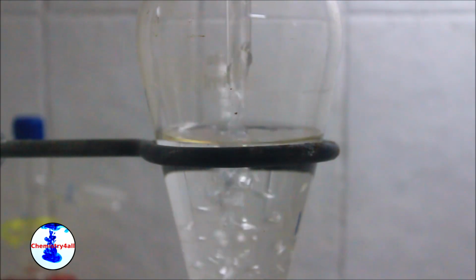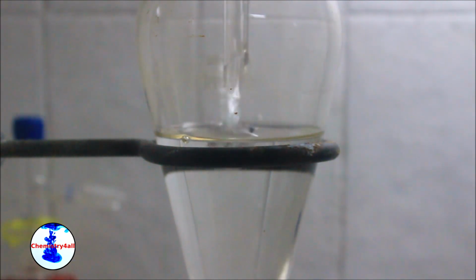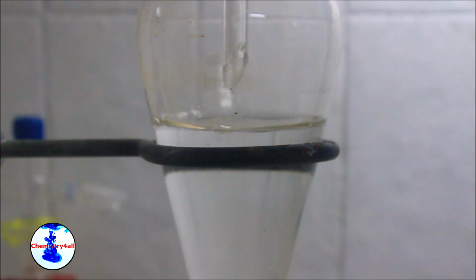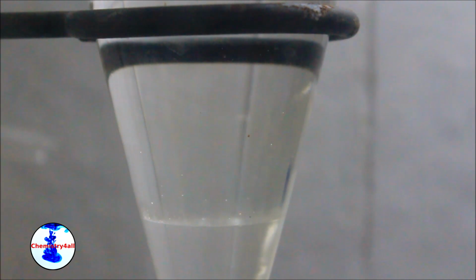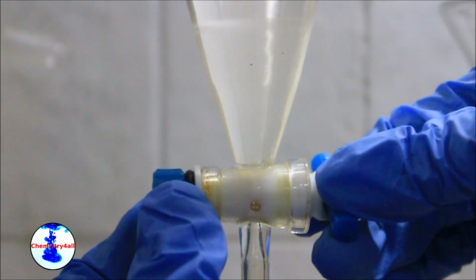It's then washed twice with a sodium carbonate saturated solution. This step should get rid of any traces of acid left within our product. The aqueous phase can be then discarded.